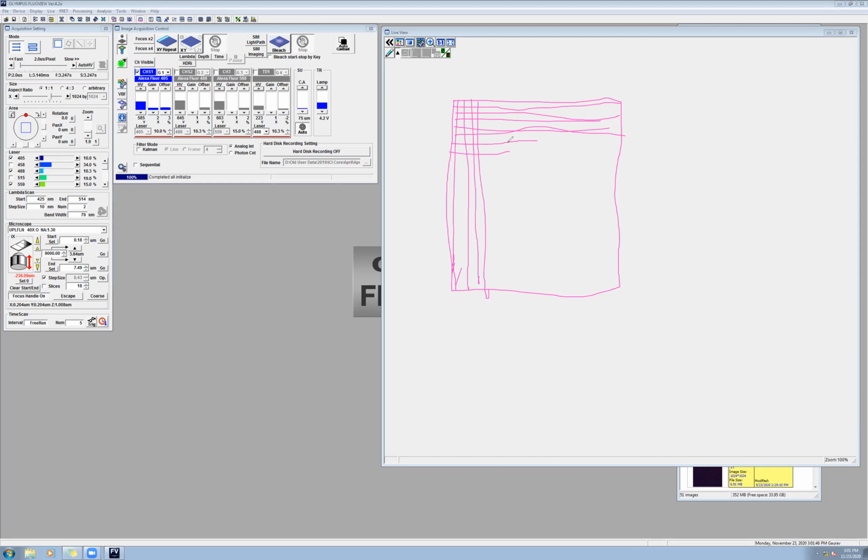When we are doing focus times 4, what it does is it scans the first region, it skips the second, and it skips the next 3 and images the fourth one.